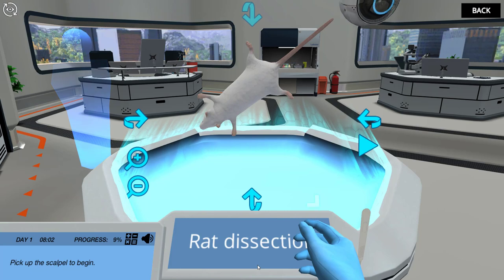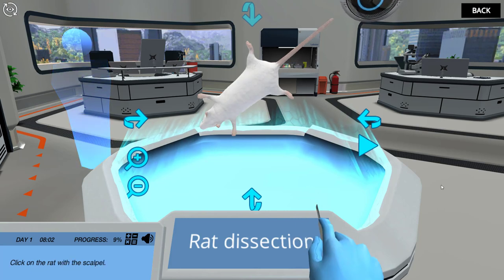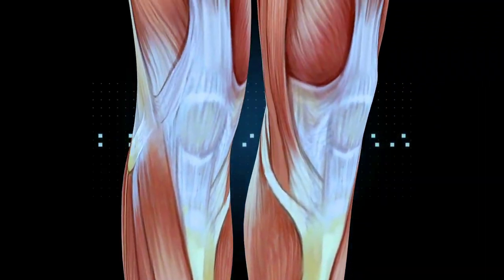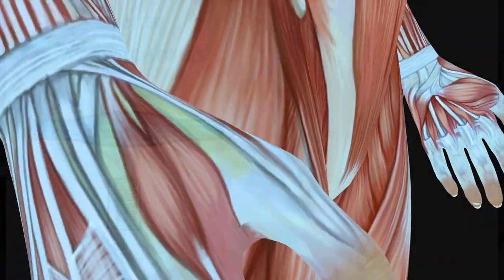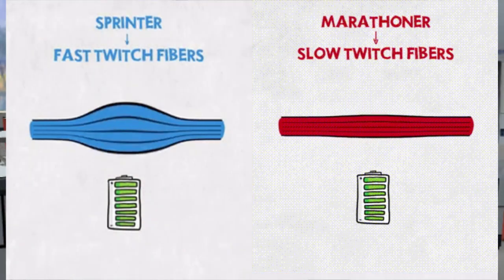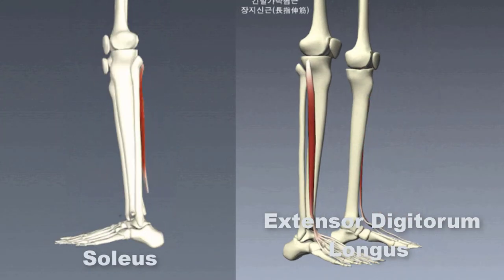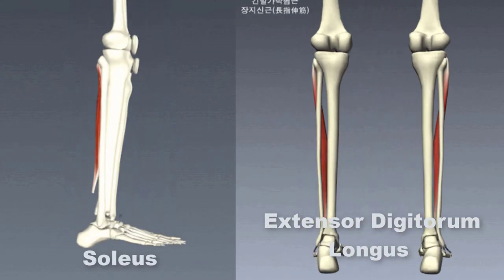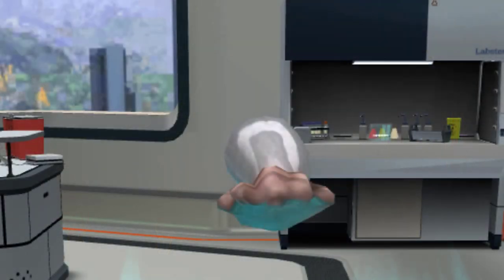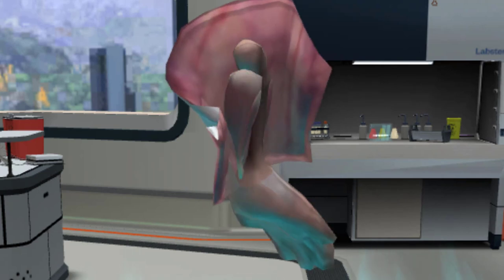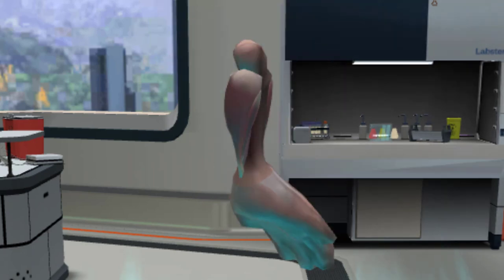Pick up the scalpel to begin. Click on the rat with the scalpel. The leg has many muscles. Today we are focusing on two muscles with different fiber compositions, one that has slow twitch fibers and one that has fast twitch fibers. Click on the rat leg to open the leg for the muscle dissection. Click on the rat leg again to remove the skin and fat. This will expose the muscles below.